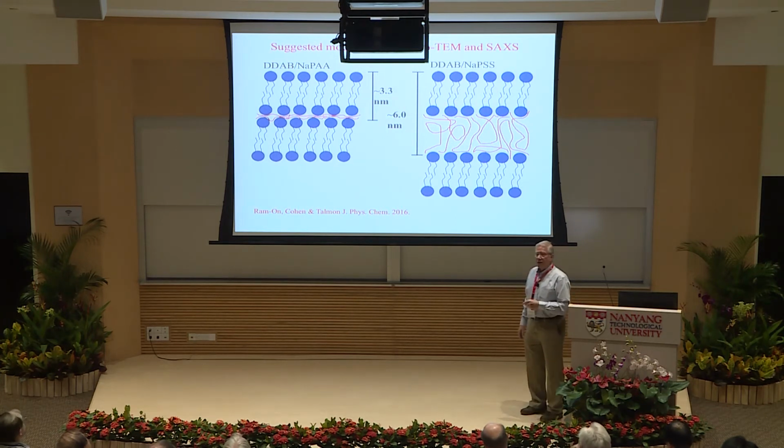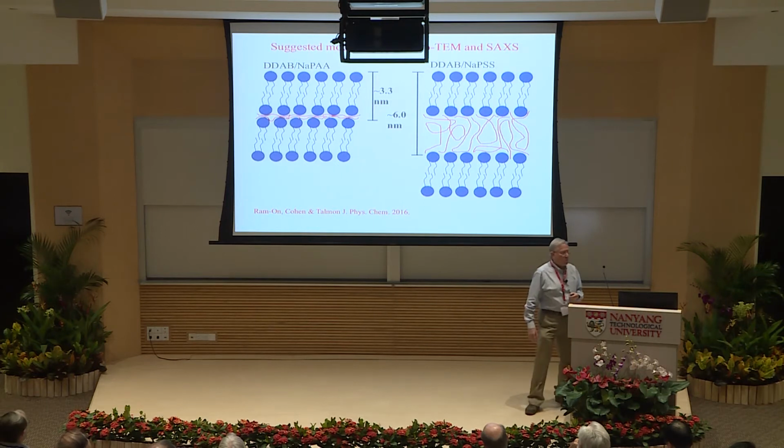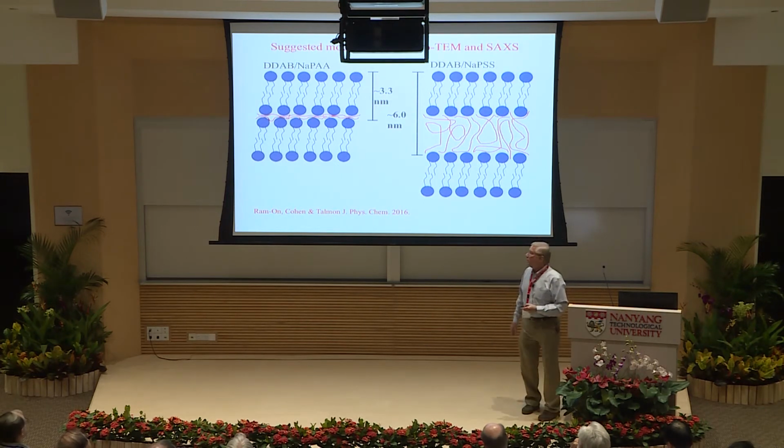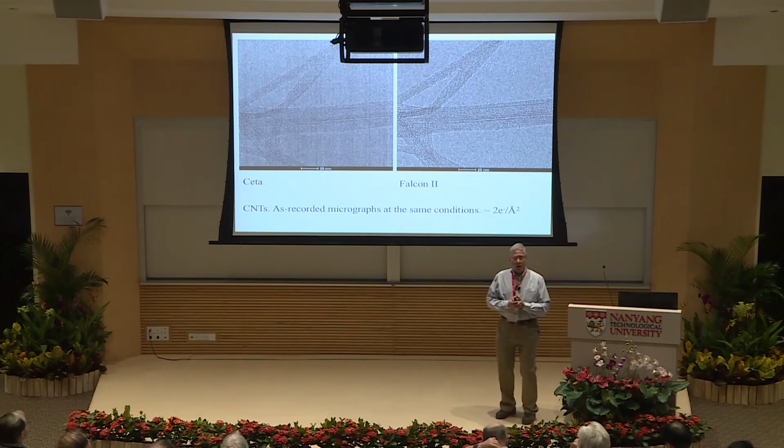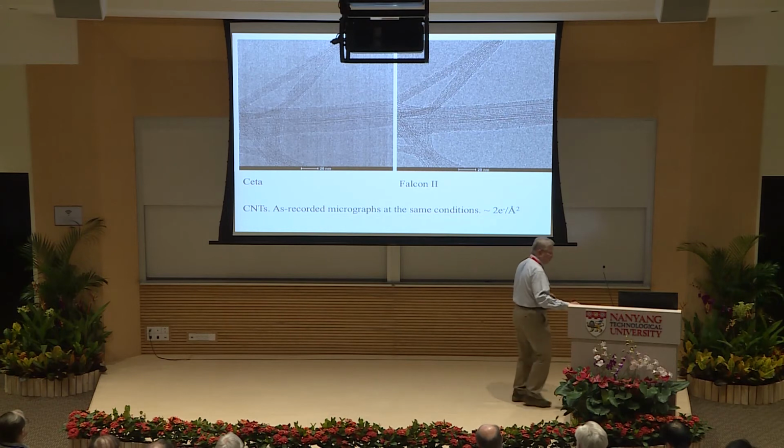Okay, saying this, let's move to the present. This is not that old. This was published about 1.5 years ago. So let's go now to the present. In the present, we have a new microscope. And it's not only that we have a new microscope. The community has new microscopes which can do much better things than what we were able to do before.